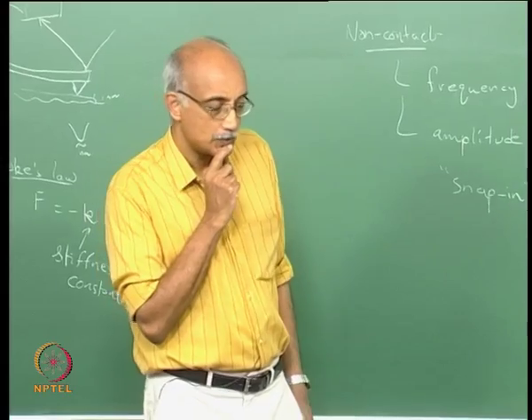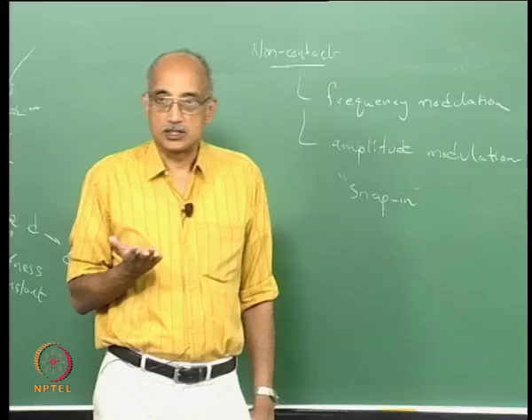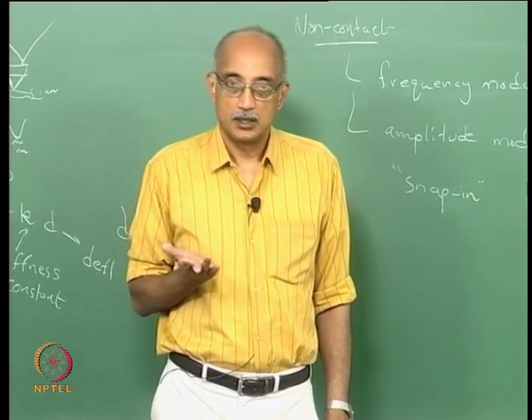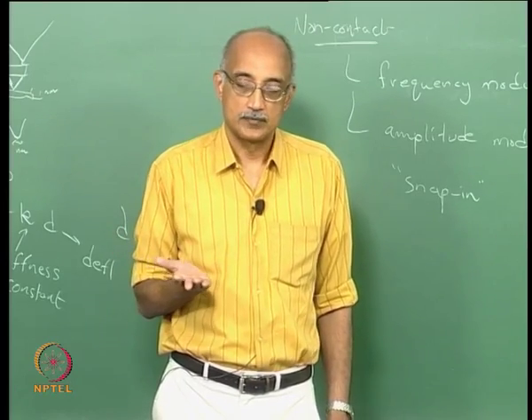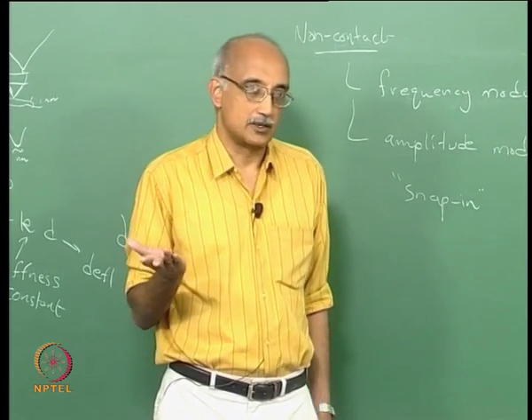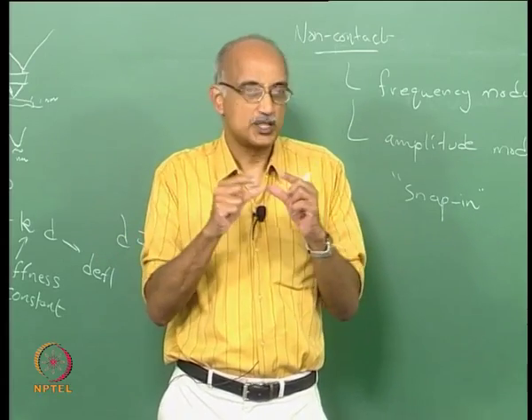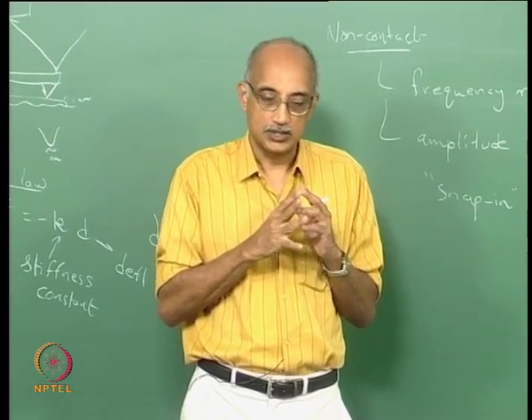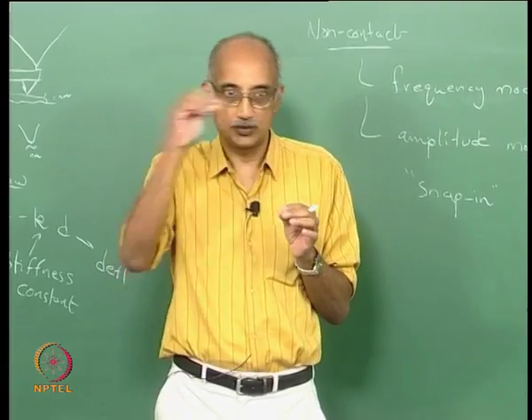X-ray diffraction is used because most materials are crystalline in nature. Something like 95% of naturally occurring materials and virtually 100% of man-made materials are crystalline in nature. Now what does that mean? What is crystalline? A crystalline structure is one in which you have a unit cell that has a certain characteristic, and the structure of the entire material essentially replicates this unit cell in 3 dimensions.